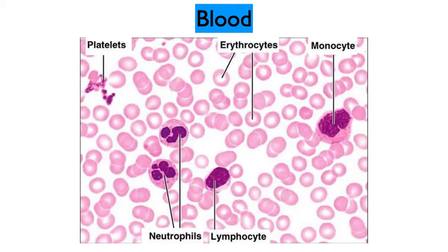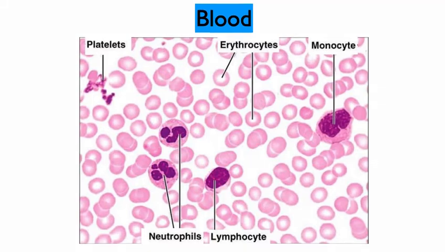When we talk about the circulatory system, we can talk about the particulars, the number of lobes you look for. You can see that just on inspection here. They have different numbers of lobes. It allows them to be identified and distinguished from one another.